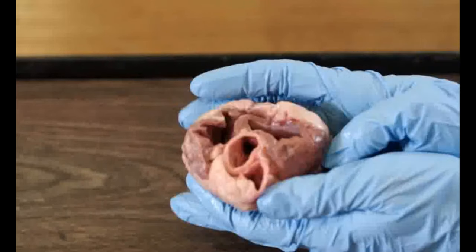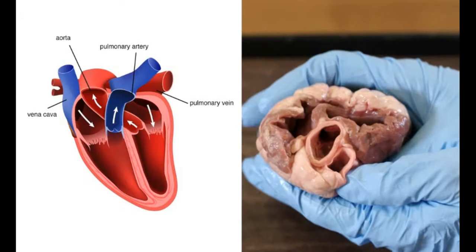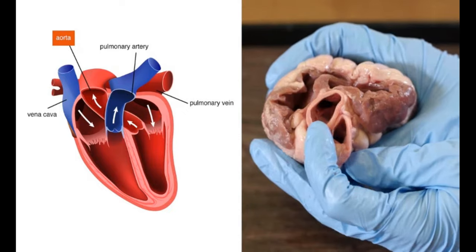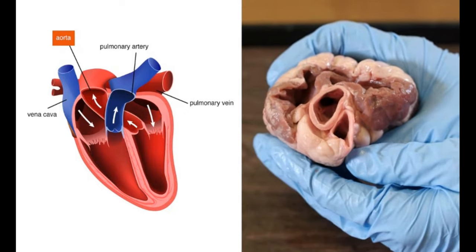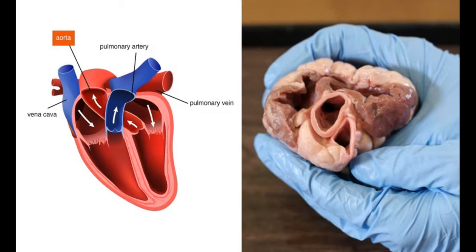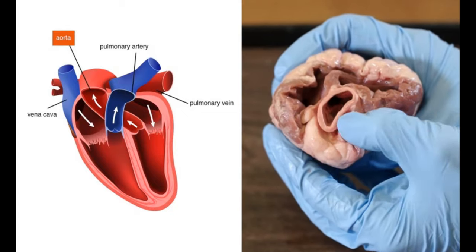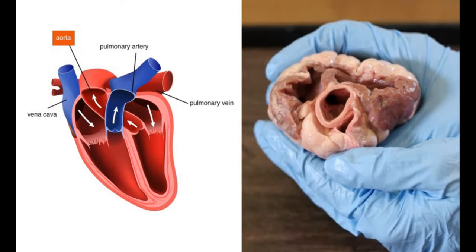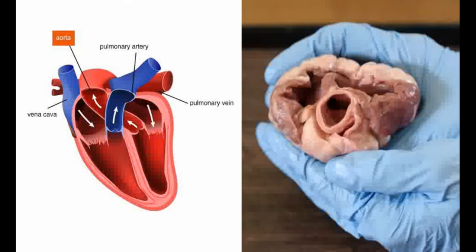Now let's look at the blood vessels. This is the aorta. It is the largest artery in the body. It carries oxygenated blood out of the left ventricle all around the body. Notice how thick its wall is. This helps it to withstand the high pressure of the blood as it is pumped out of the heart.